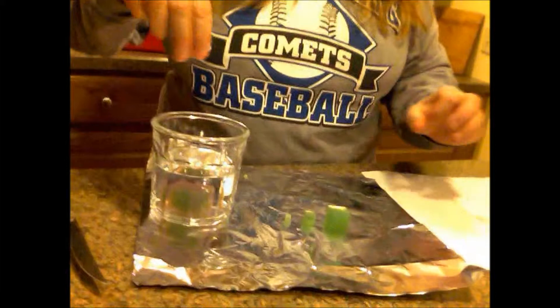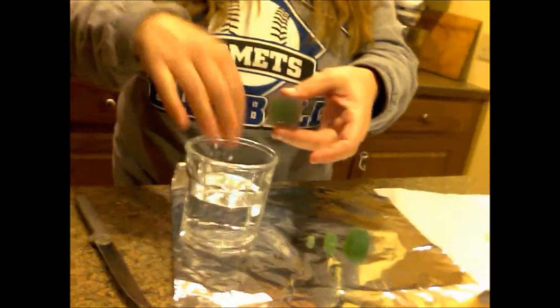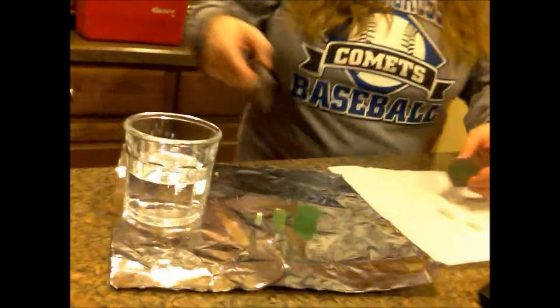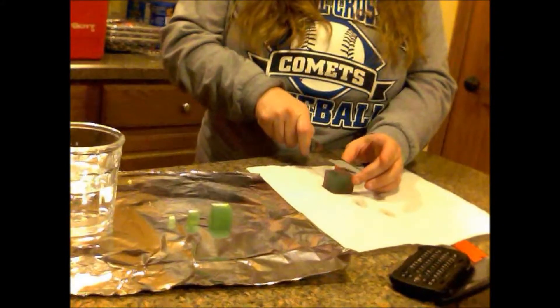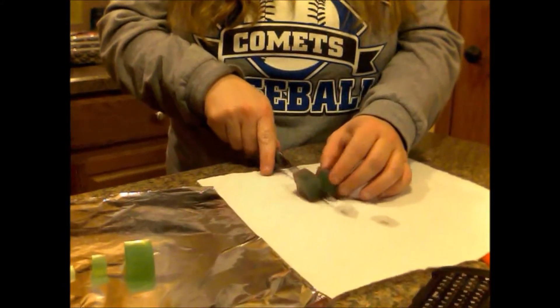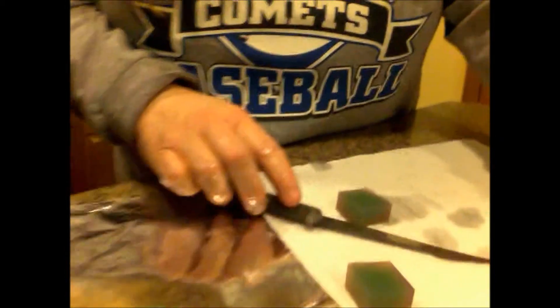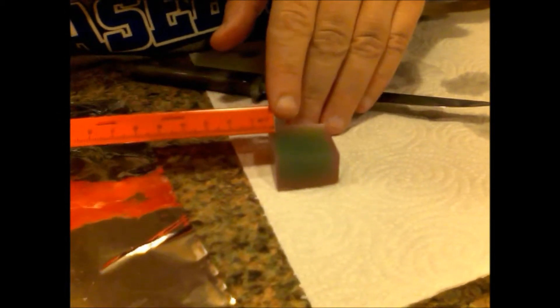Once that minute is up, you're going to reach in and take the block out. Put it on the paper towel. Try to keep the vinegar away from all your other blocks. And once you cut this, you will see that the vinegar seeped in a little bit. You need to immediately measure how many millimeters it went in. If you look at this, it's about two millimeters. It doesn't really matter which side, but you need to record that in your data table.